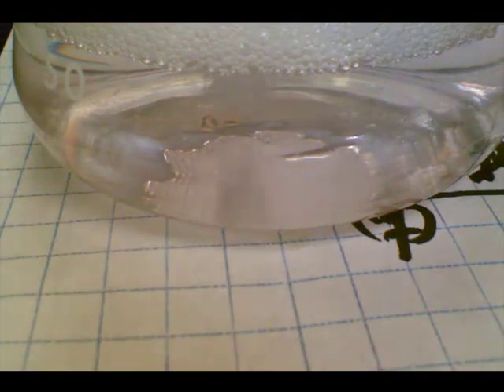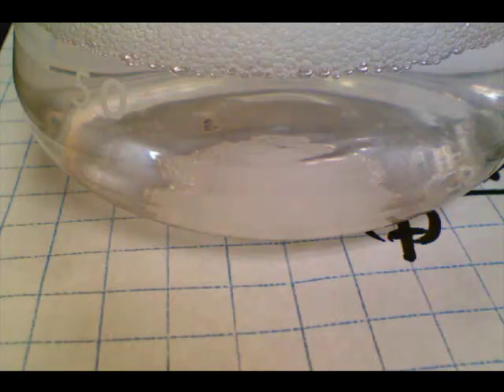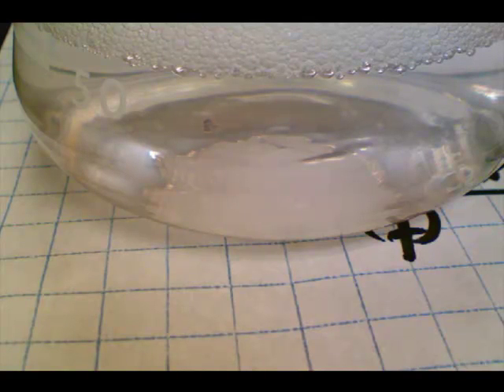Did you see what just happened there? I had a solution that looked very faint pink after adding a few drops at a time, and then down to 1 drop, and then to even fractions of a drop. And then I added a small part of a drop, and it changed from the faintest pink into something that's not pink at all. I've just reached my endpoint.